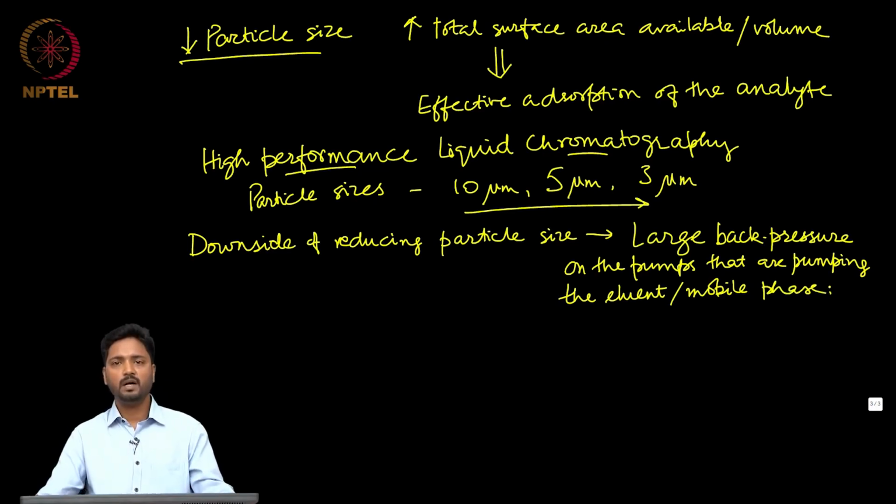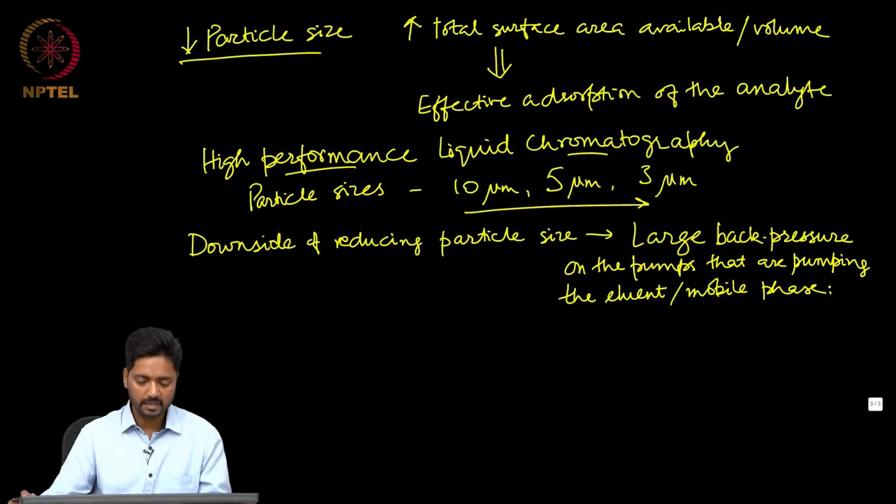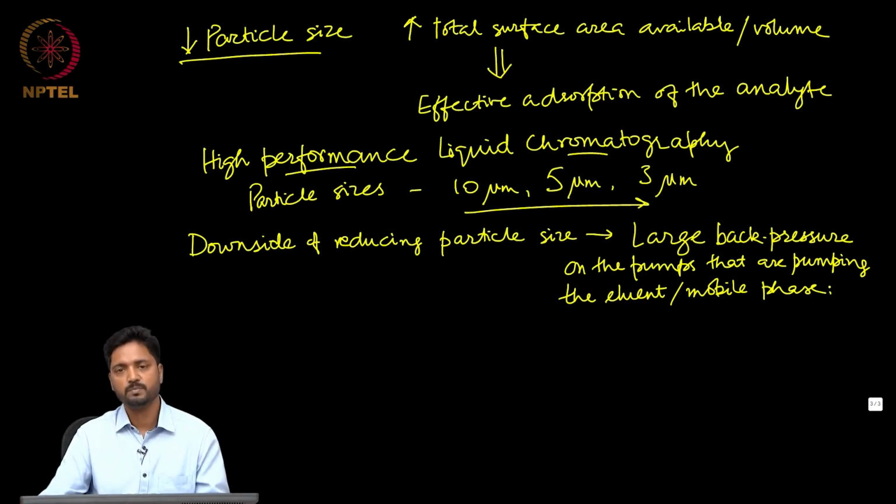So, this becomes a very significant technological challenge, and is also an important parameter to be considered in terms of the cost of the equipment, because as we keep reducing the particle size, we will require high efficiency pumps and high performance pumps whose costs become quite a significant consideration in undertaking the purchase of the equipment.